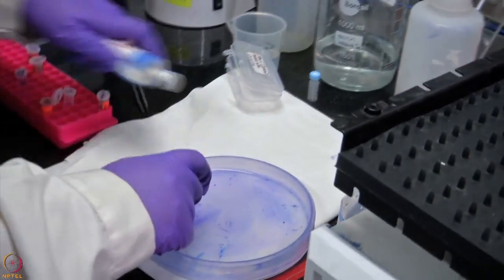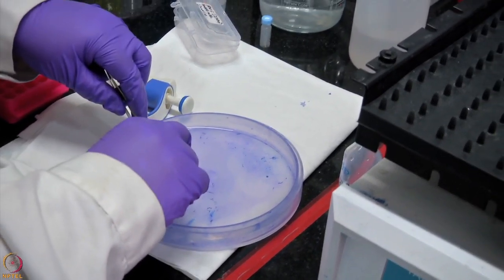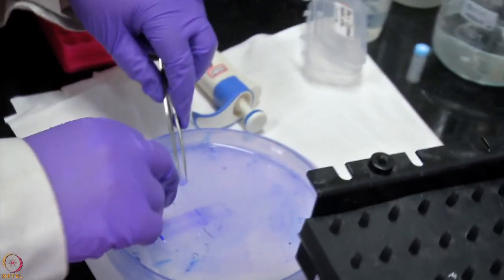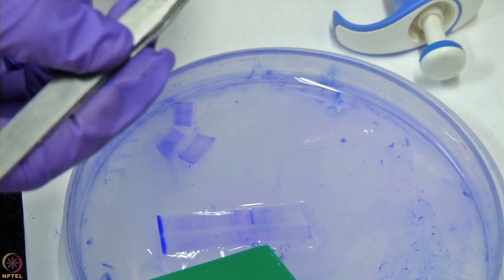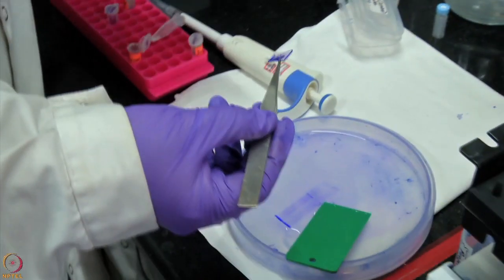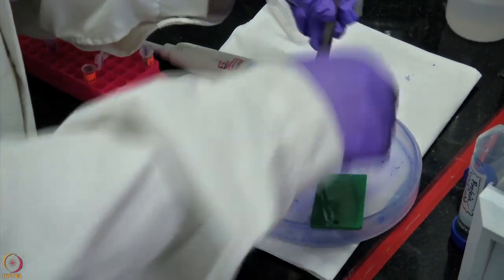We will cut the gel and make small pieces depending on the number of fractions you want to do. For example, I'll cut this lane into 4 pieces. You can see there's a prominent band here. This looks like the protein of interest and probably many of the proteins that have formed a complex with it.